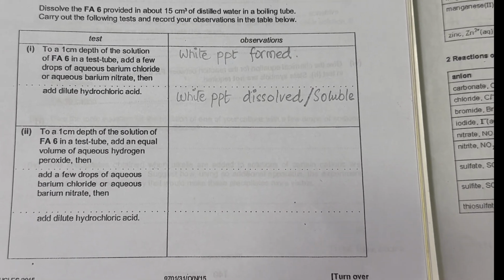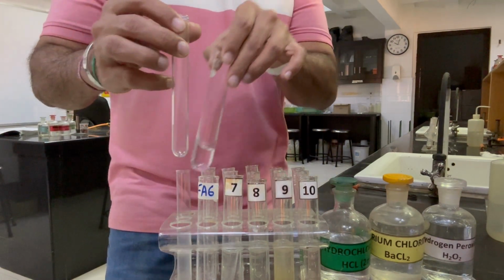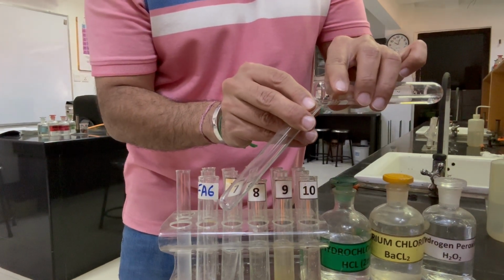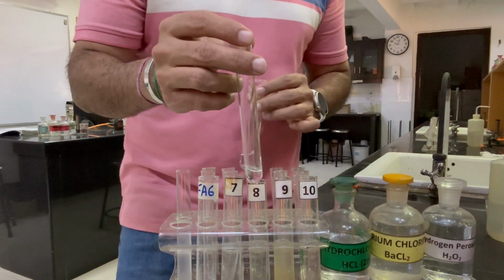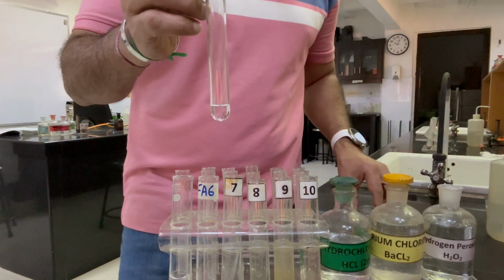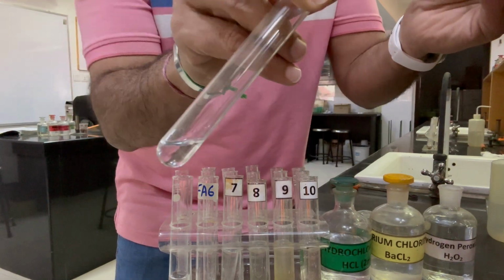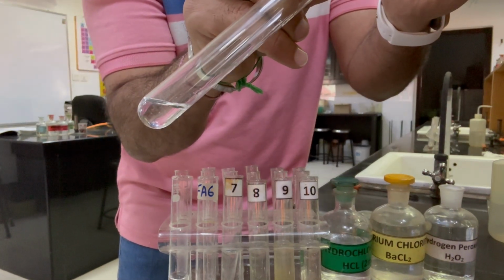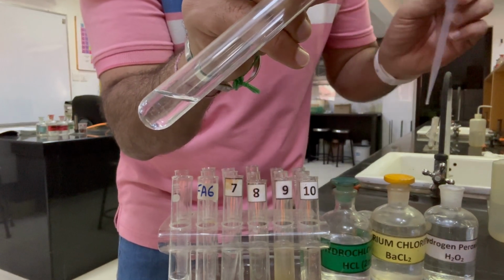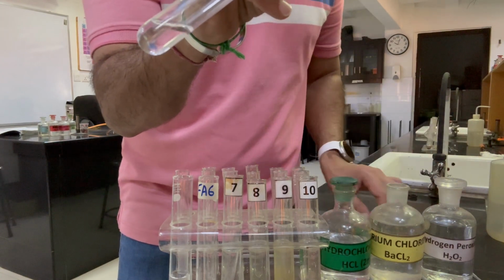So let's perform this test now. Now I will take in another tube 1 cm depth of the solution prepared, Fa6, 1 cm depth. And now I will add hydrogen peroxide. As soon as I have added hydrogen peroxide, we can see no visible change appeared. Now let's add barium chloride, a few drops.